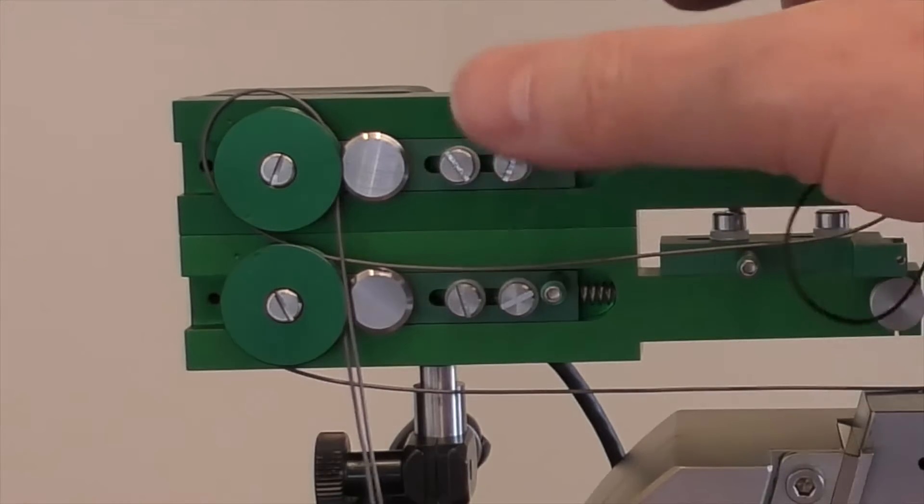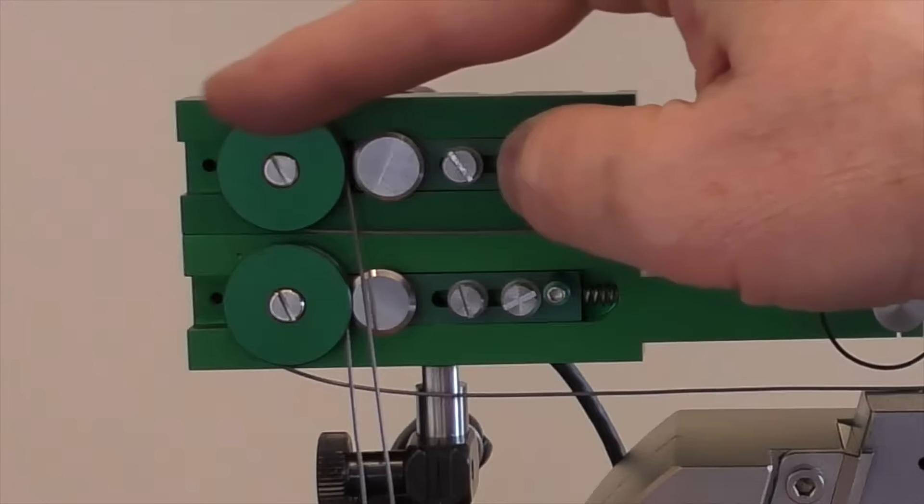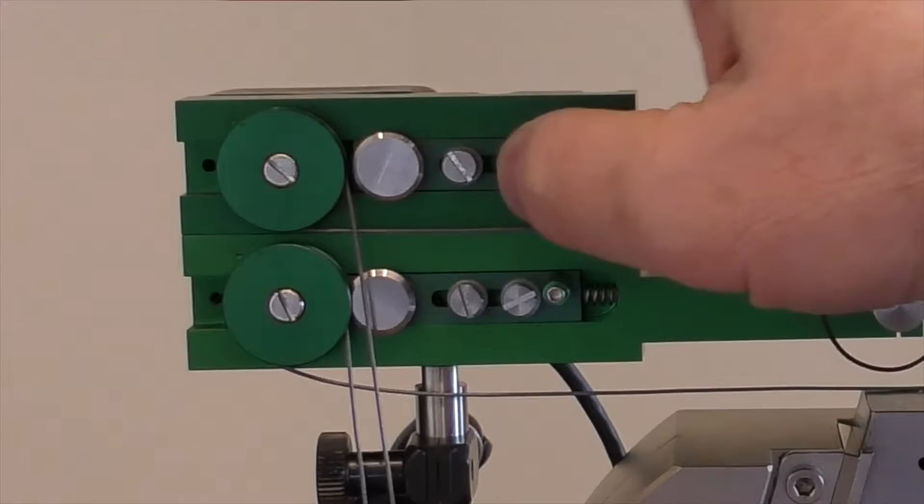Slide the pinch roller release handle to retract the pinch roller from the main roller. Rotate the main roller clockwise until it stops, then counterclockwise until the starting position mark on the main roller aligns with the mark on the extensometer's body.